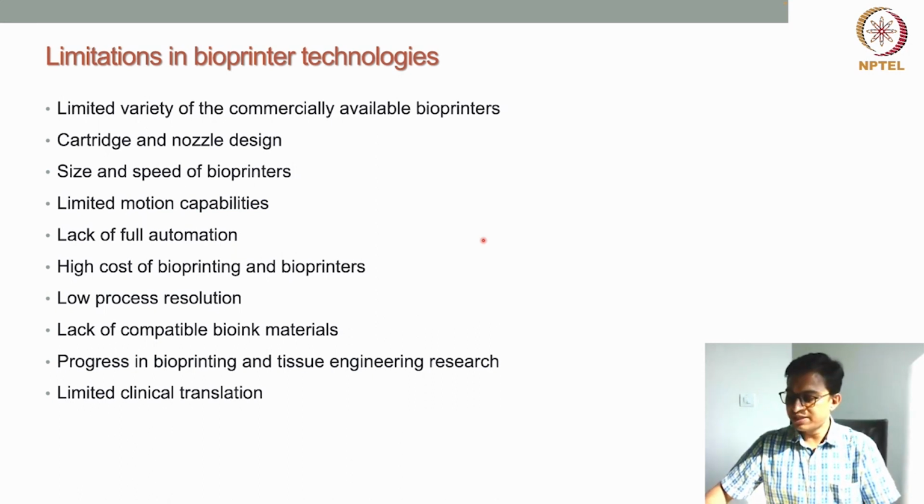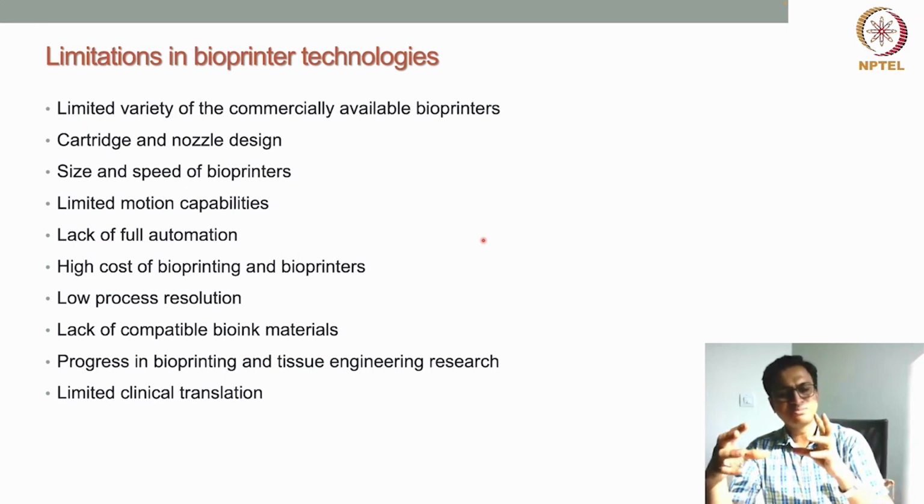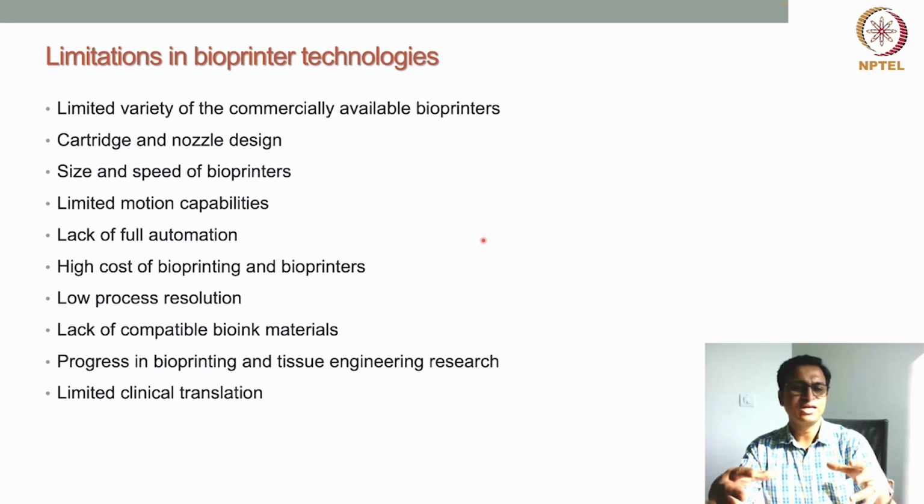Lack of full automation. Most bioprinters don't allow full automation, because some of the process is manual and only some part is automatic. Most bioprinters work in a semi-automatic space. If we want to remove user intervention from bioprinting, then full automation capability should be there.